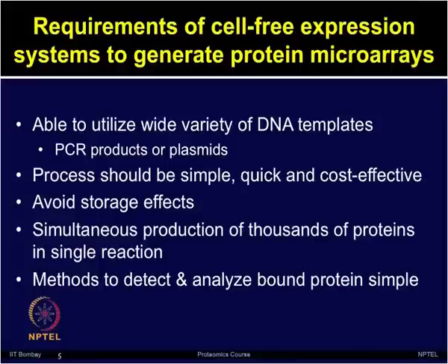Then the system should be simple, quick, as well as cost effective. When we are talking about protein microarrays, the applications are usually for various clinical studies, where one needs to screen several patients or several clinical samples. So, if the technology is very costly, that becomes one of the limiting factors for its widespread use.